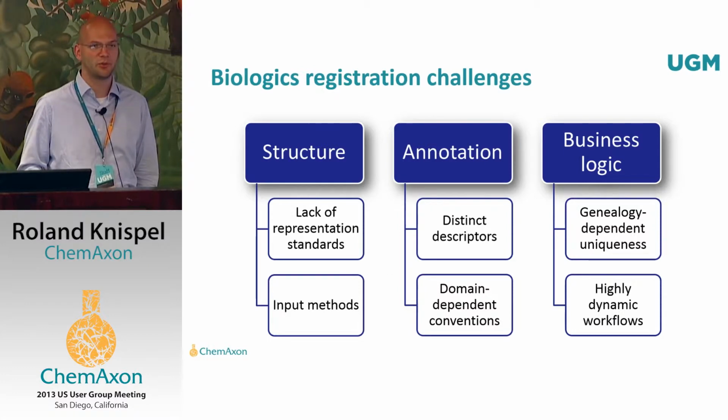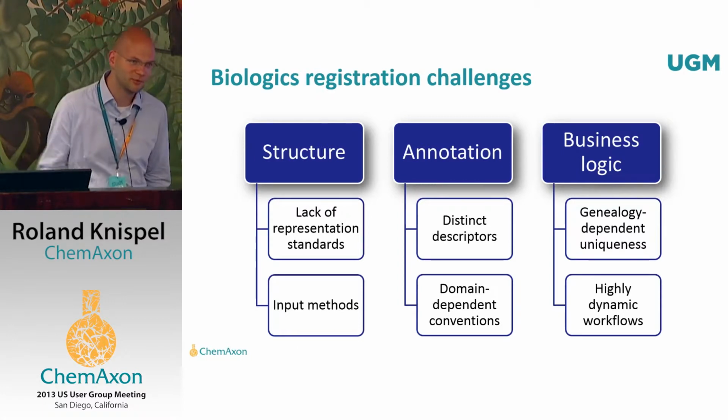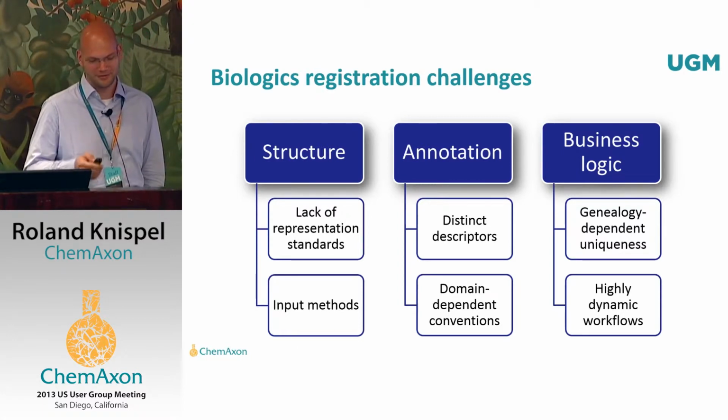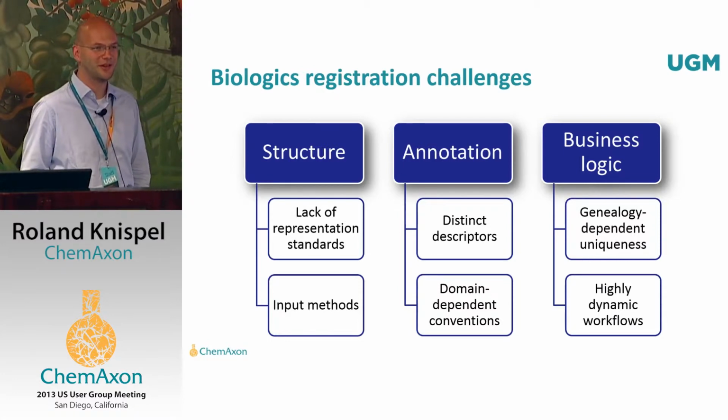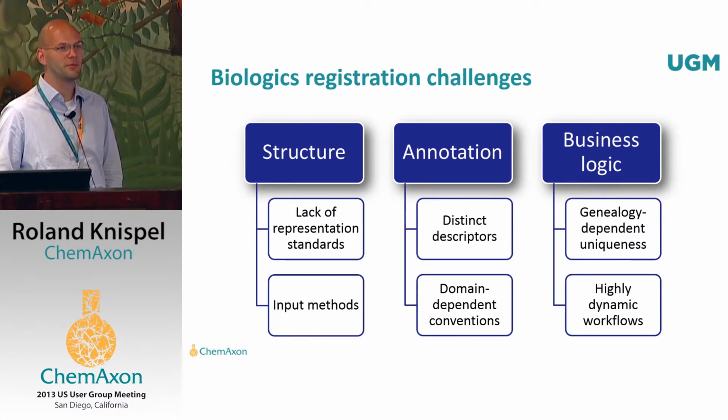And unfortunately, 6 weeks later, they had a major revision of their antibody development workflow, which rendered the entire system essentially useless. And obviously, we are aware of it, and we need to accommodate these kinds of technology changes while being able to provide a system which is flexible enough to cope with that.